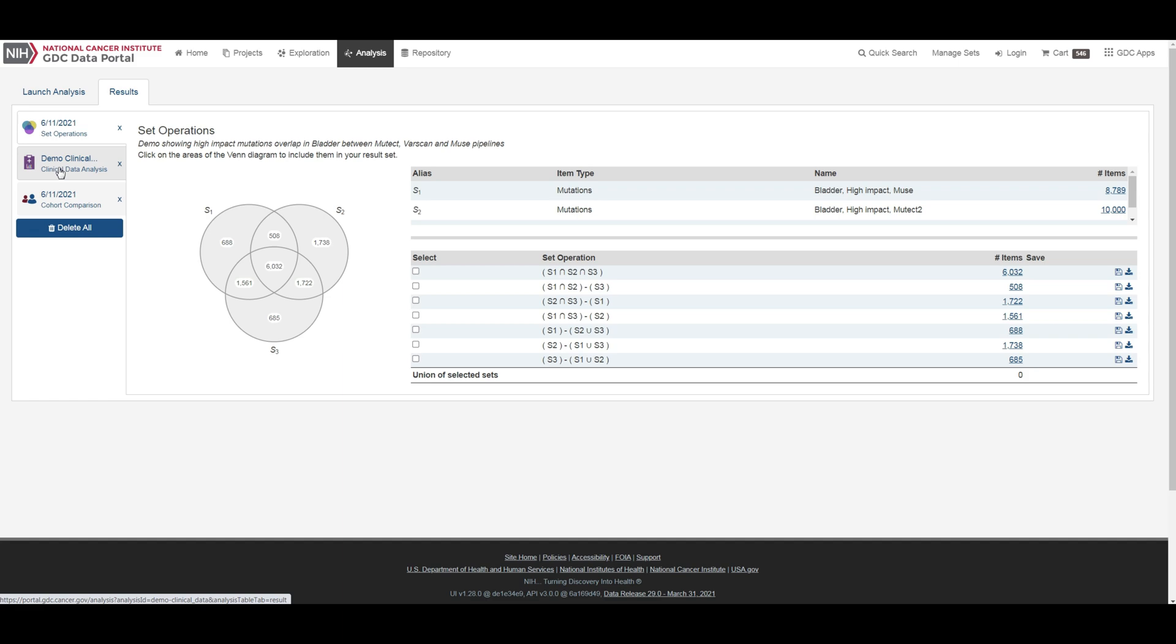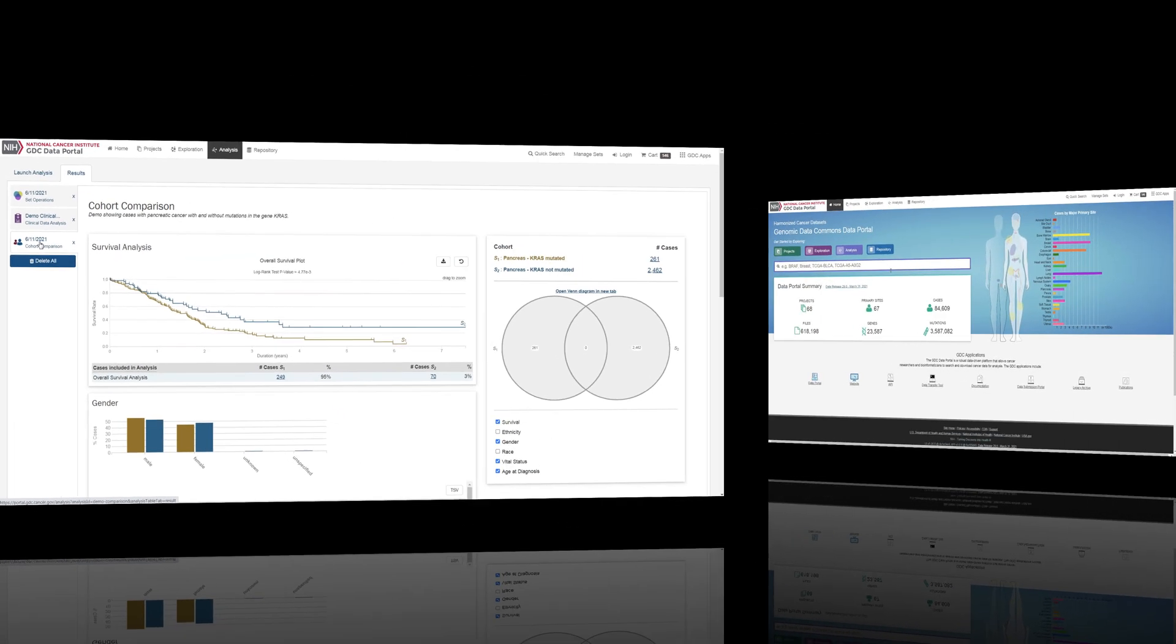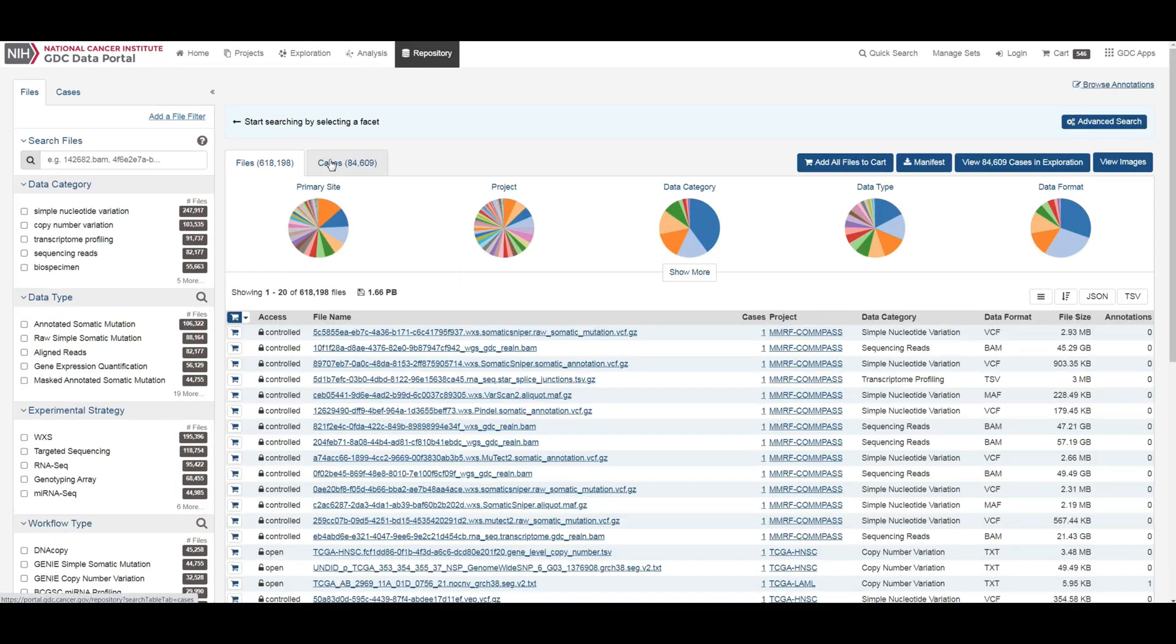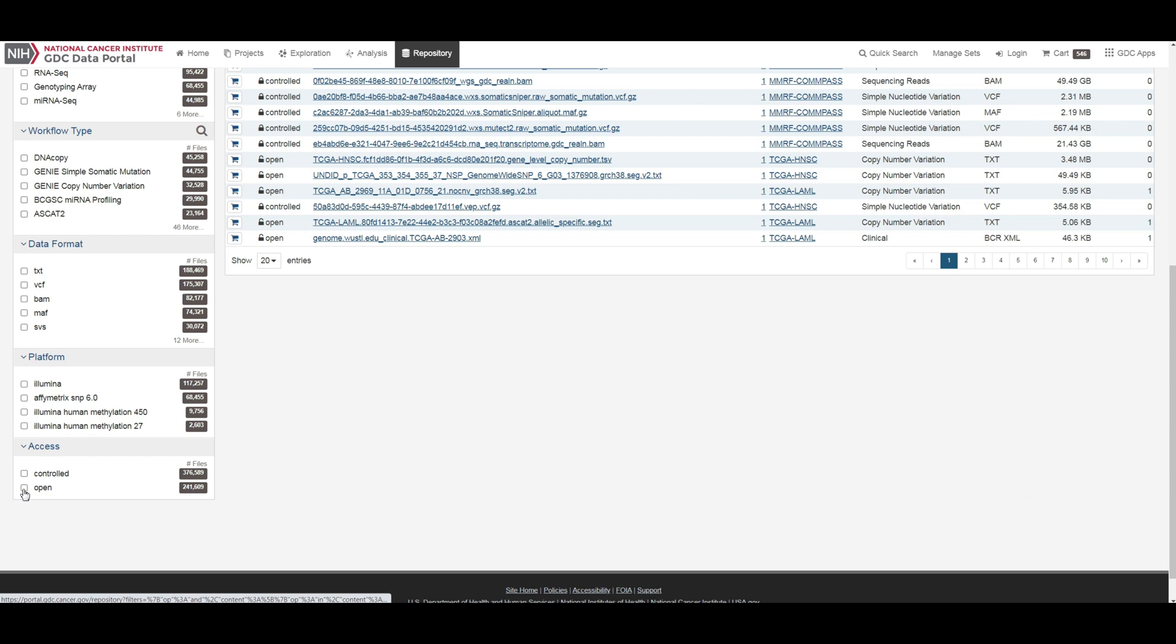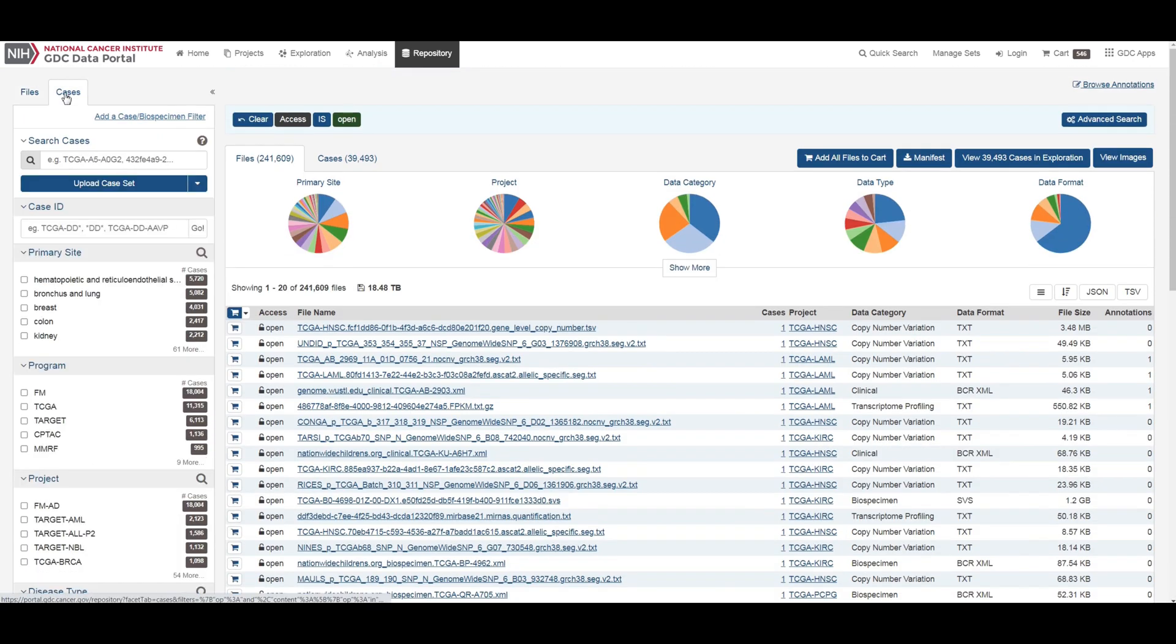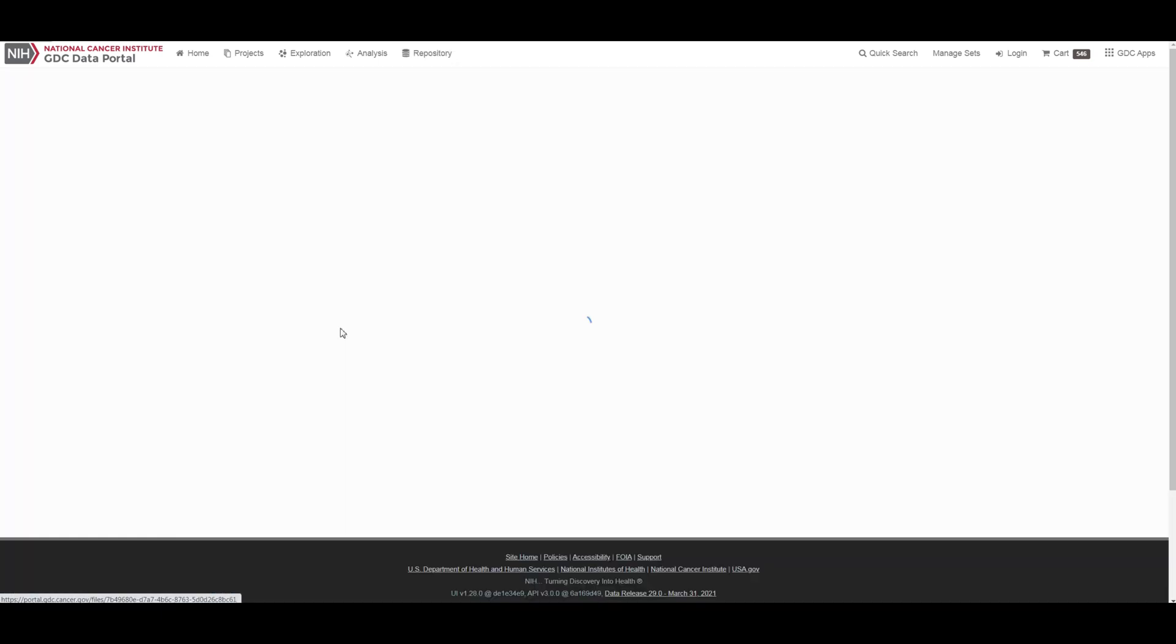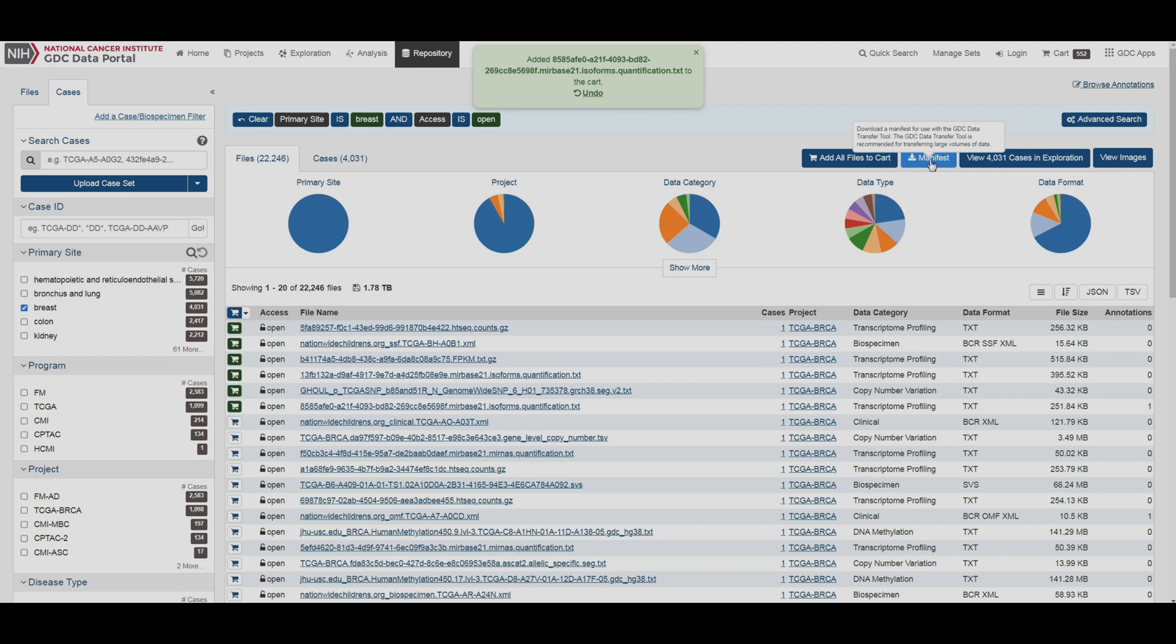Finally, the repository page is the primary method of accessing data in the GDC data portal. Individual files can either be downloaded individually from file summary pages or collected in the file cart to be downloaded as a bundle. Clicking on the shopping cart icon that is next to any item in the GDC will add the item to your cart.